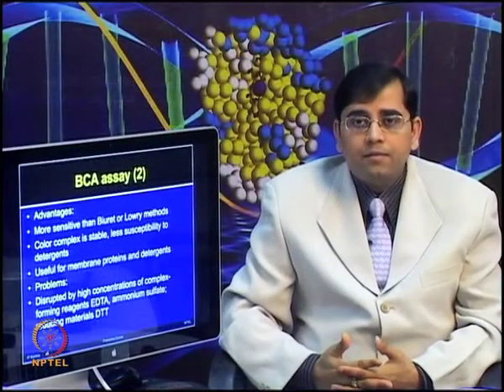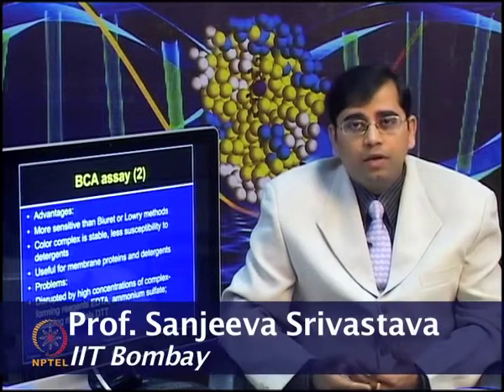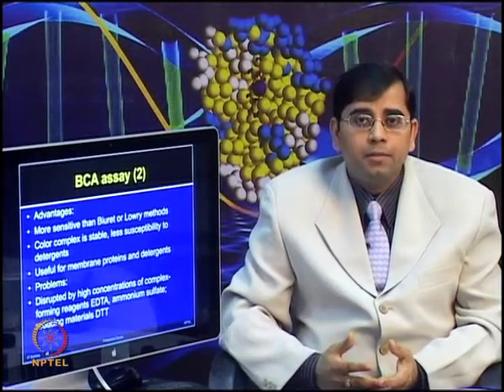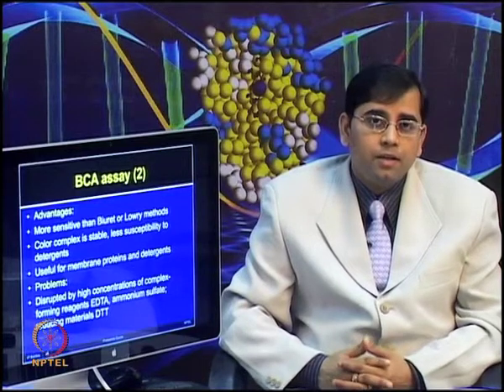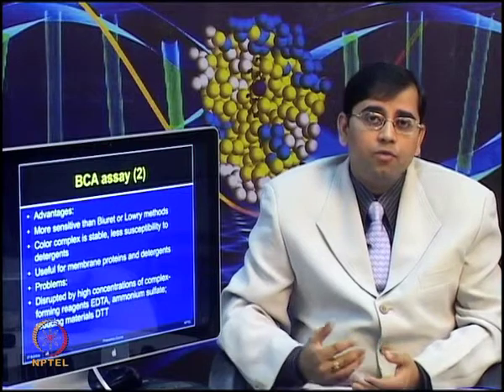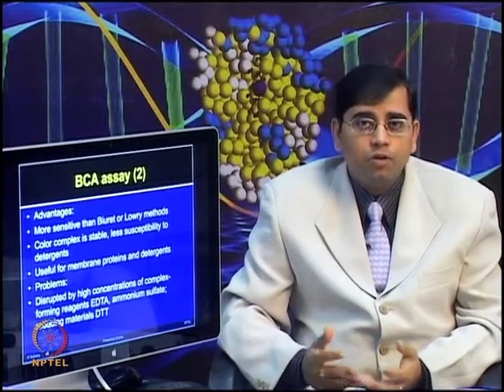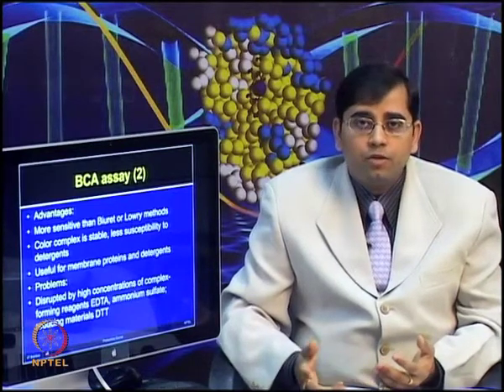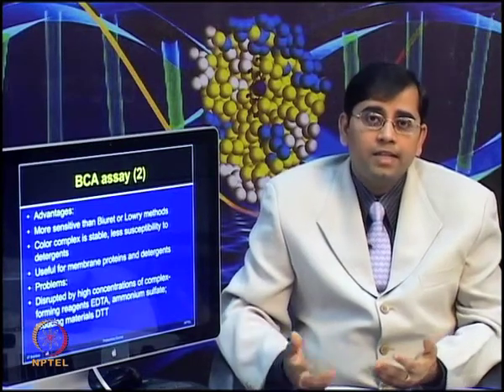So, people have tried different types of assay methods for protein quantification, because there are many interfering components which could give you a false reading, and if you are unable to accurately determine the protein concentration, then your whole analysis depends upon that, and it will not lead to the right results, right comparison. Many times you want to compare the controls and the treatments, your 50 controls with the 50 disease samples.